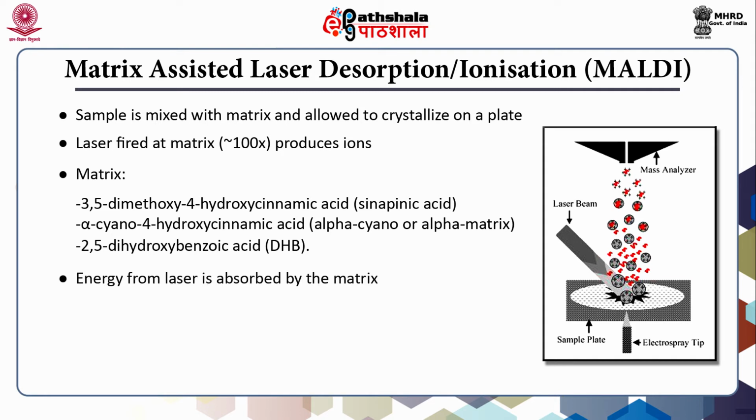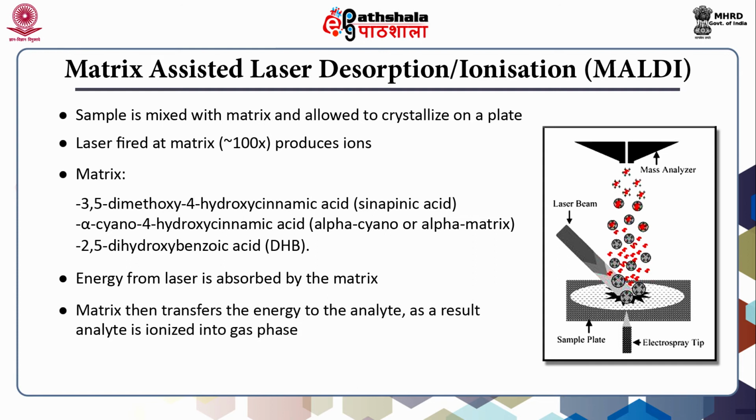When the laser gets activated, the energy is released and hits the MALDI plate. Energy from the laser is absorbed by the matrix, and the matrix then transfers the energy to the analyte. In this case the analyte is the peptide. As a result, the analyte is ionized into the gas phase, and the gas phase analyte travels in the electric field. In this way the sample has been ionized.